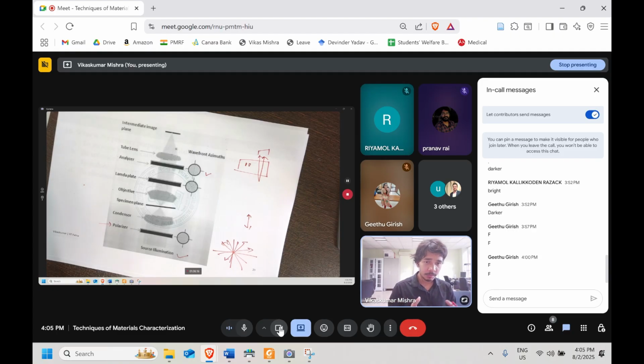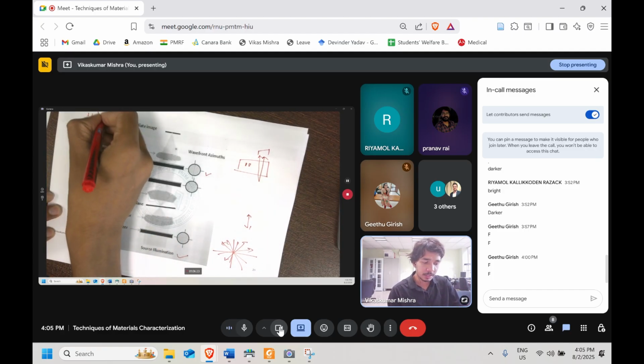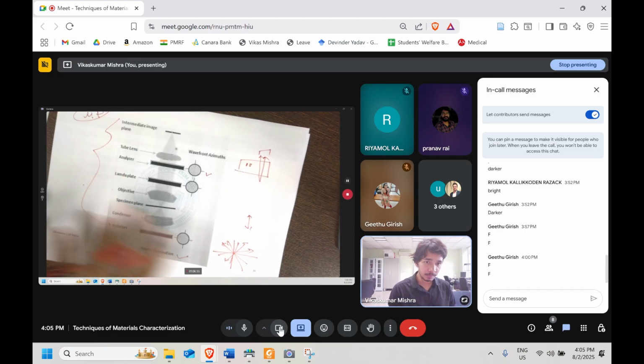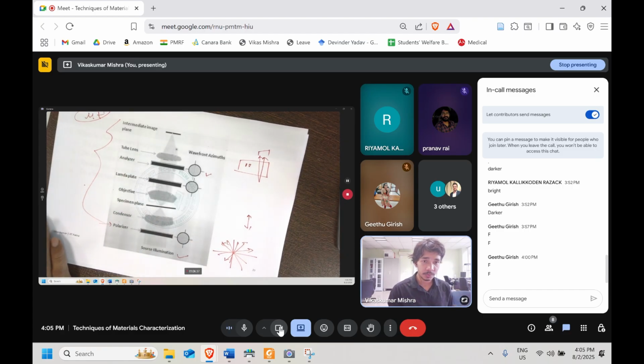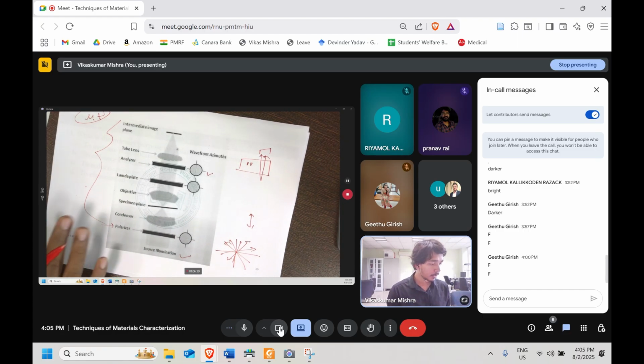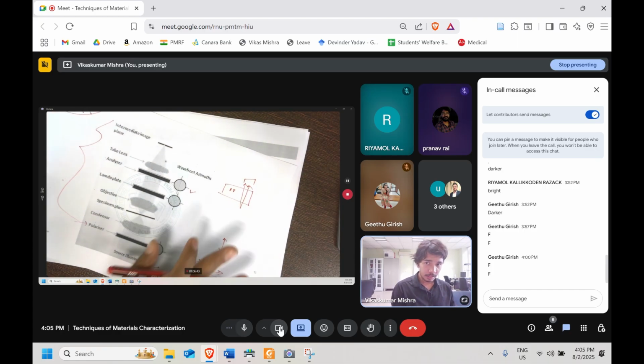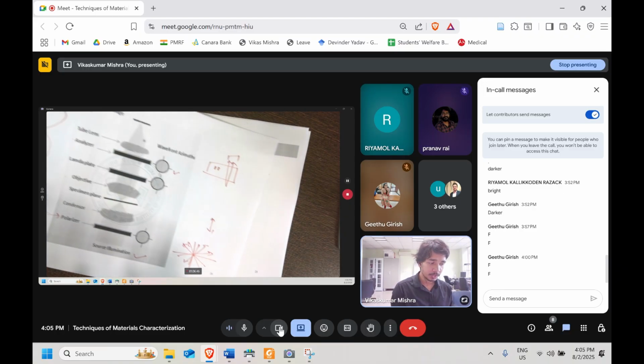We are just not able to see the 3D image of it, but we can see the refractive index and the thickness. Also, we know that if the material is anisotropic, different directions will give different refractive index, and that is what we are going to see in polarized light microscopy. Okay, if any doubt, let me know. If not, let's try to solve a question based on this.